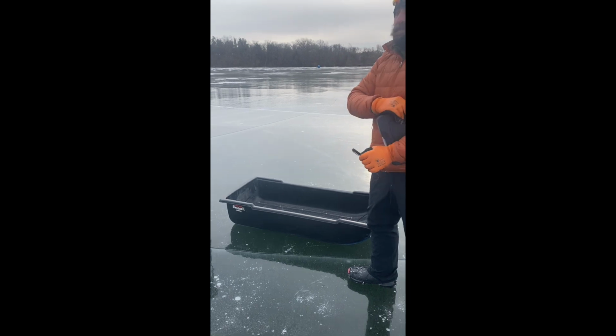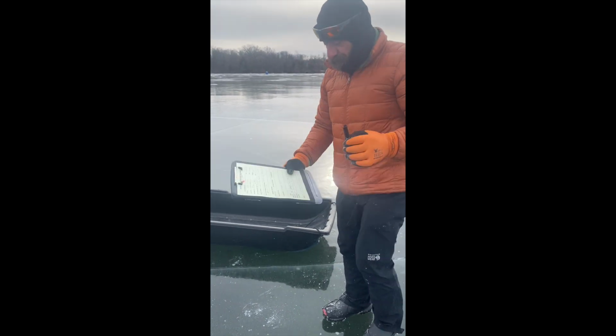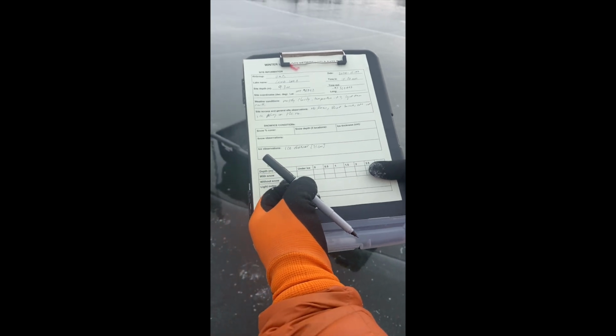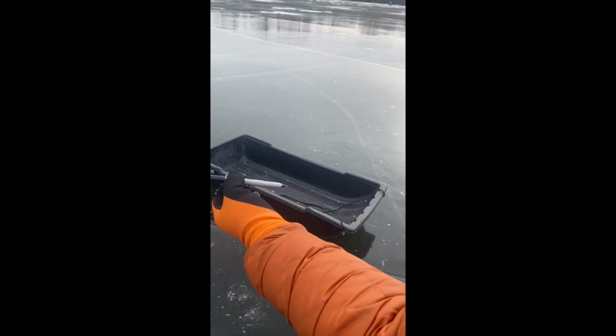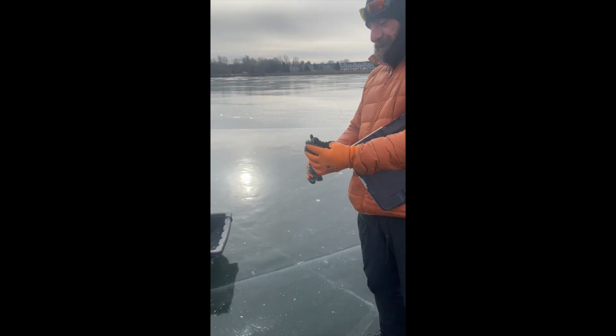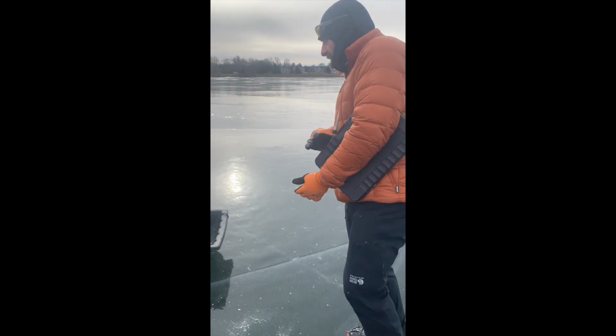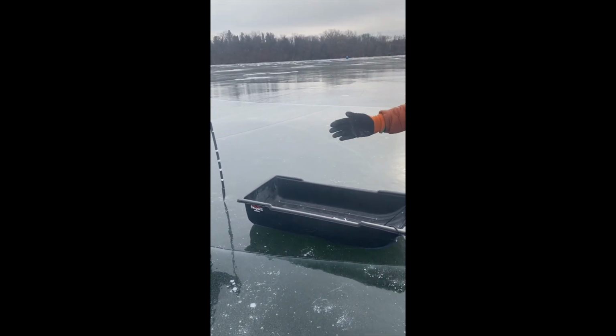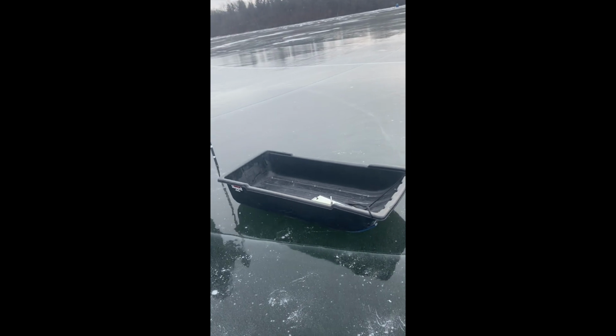ice. Now, if you notice in the profile, we're asking you to do a profile with snow and without snow. Again, because there is no snow here, we're going to explain what we mean with snow and without snow, but we're just going to do the profile without snow. But again, the first step is to create a hole for your light meter, minimizing disturbance to the surface.